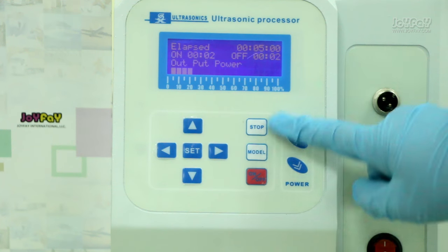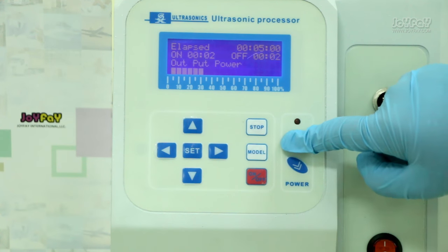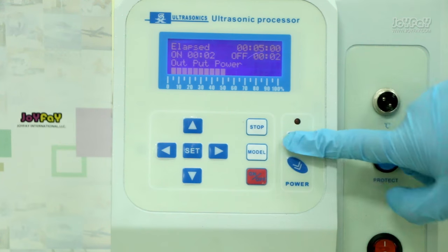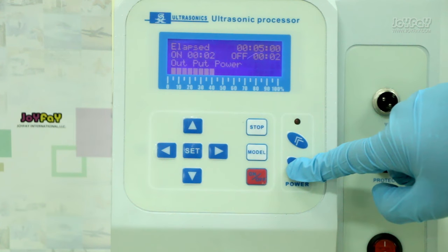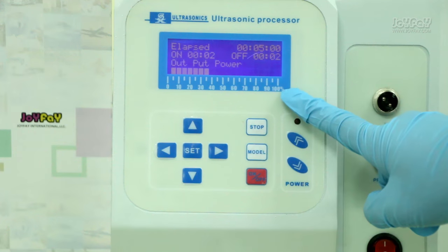Let's set the power. When you press the up button, the power becomes bigger. Each small cube represents 5% of the power.